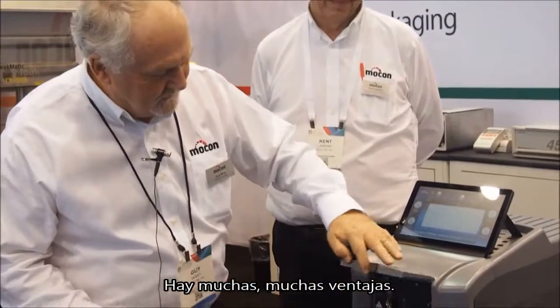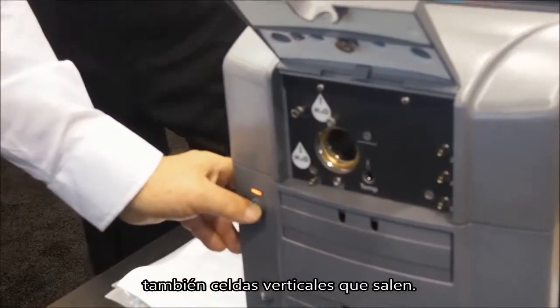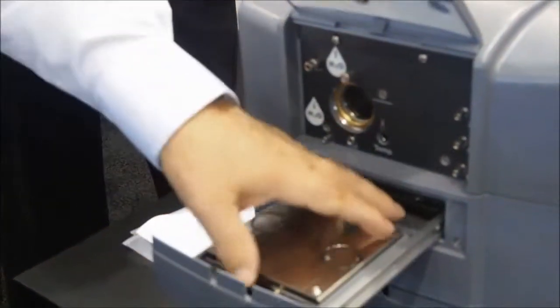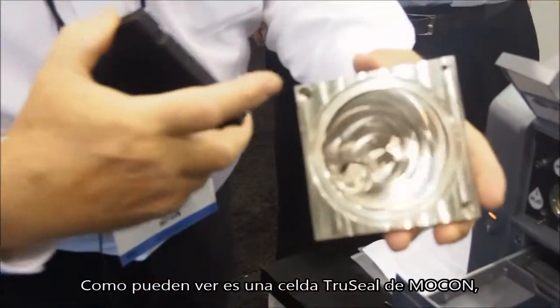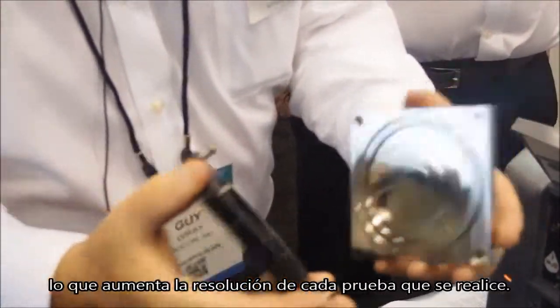There are many advantages — we have ease of use, and we have vertical cells that pop out. Here we are — this is the cell. It's very easy to get to, and as you can see it's Mocon's TruSeal cell, which improves the resolution of every test that you do.